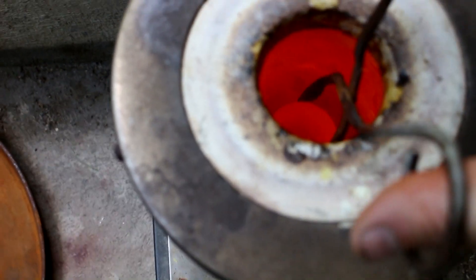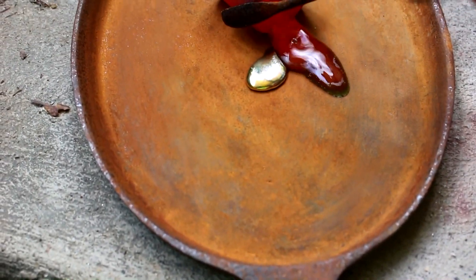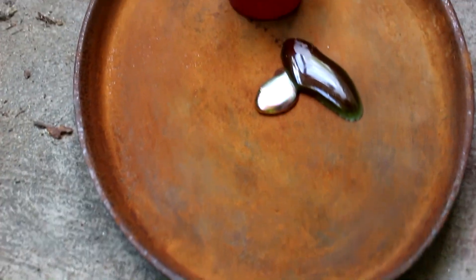Now that it's all melty, let's pull it out of the furnace and pour it out on this little metal plate. That should be my silver and lead alloyed together. Now all I've got to do is separate them.